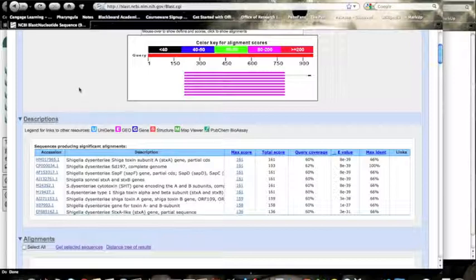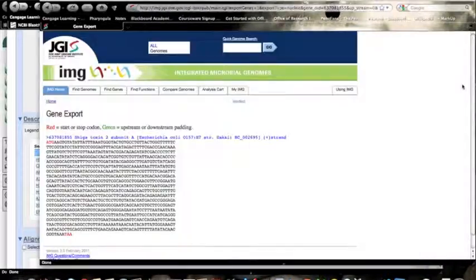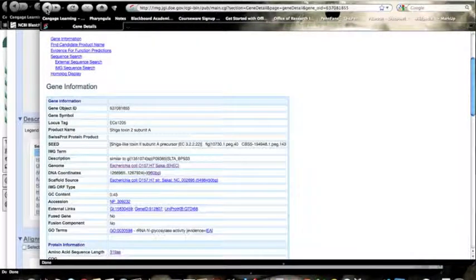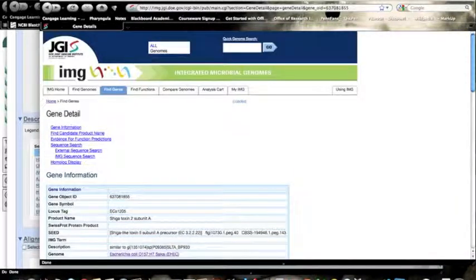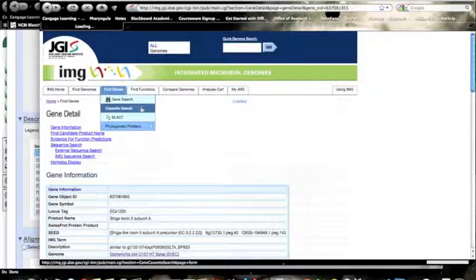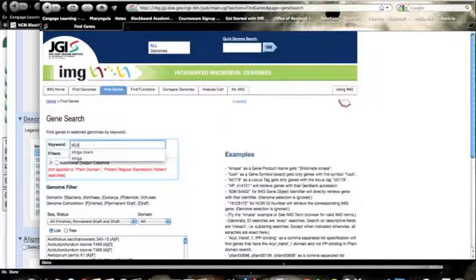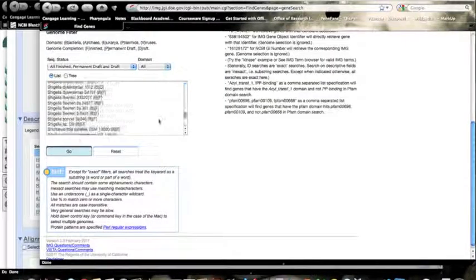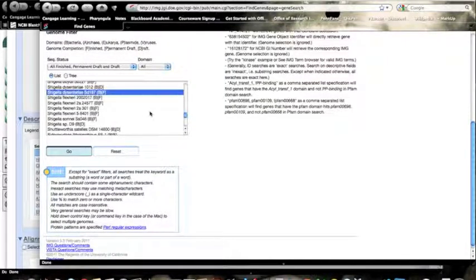So you can go back and look at the network neighborhoods in your other example. So if we went back here and decided to add to our cart, we'll do a gene search. Let's look up Shigella dysenteriae.